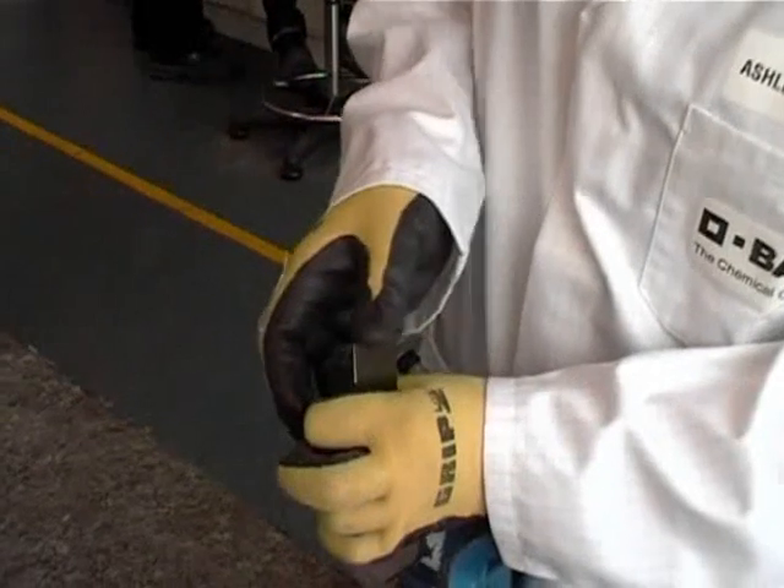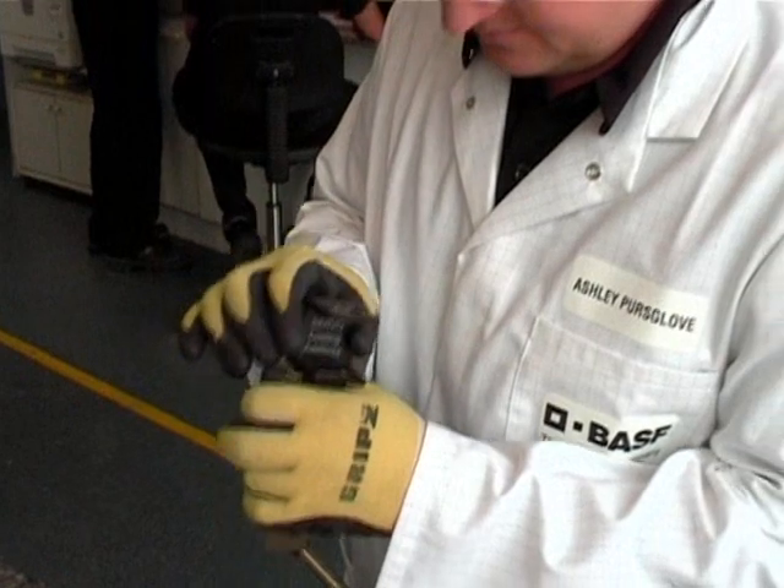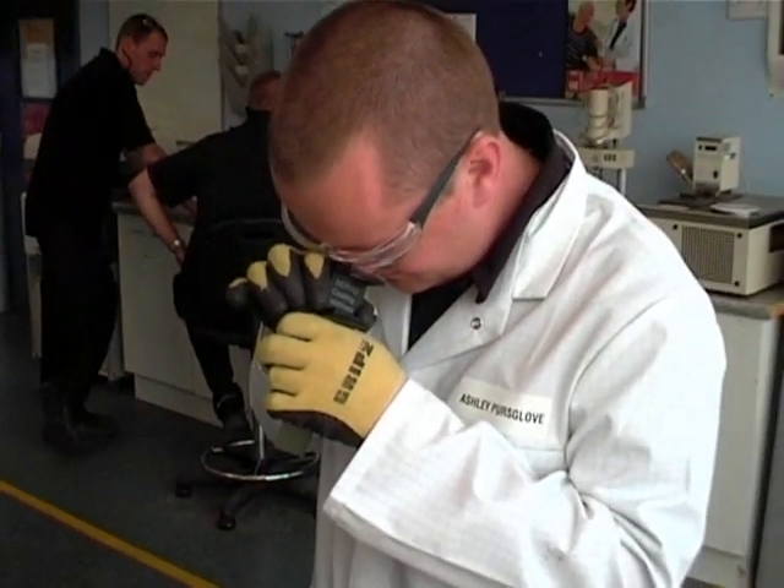To assess any cracking, self-adhesive tape is applied to the bend to remove any loose paint. When this is removed, the paint on the bend is inspected closely.